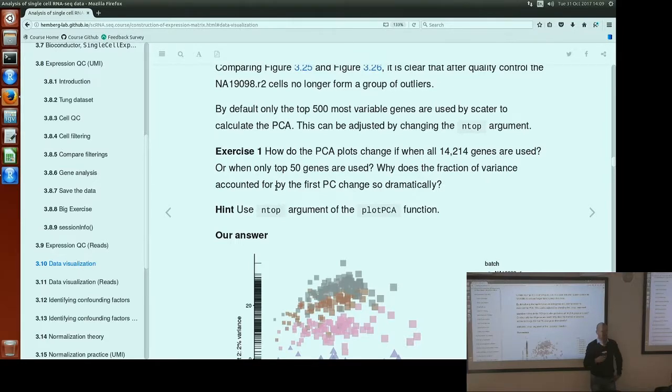Yeah, so normally we do this on log scale, normalized counts. That's sort of the most effective use of PCA, I think. In terms of a single cell experiment object, by default, the plotPCA function will look for that logcounts element, and it will use that by default unless you tell it to use something else. And one final thing, logcounts in scater is synonymous with the function exprs. We incorporated that for backwards compatibility with SCESet objects. But you can access those log counts either with the logcounts function or with exprs, and they'll give the same stuff.